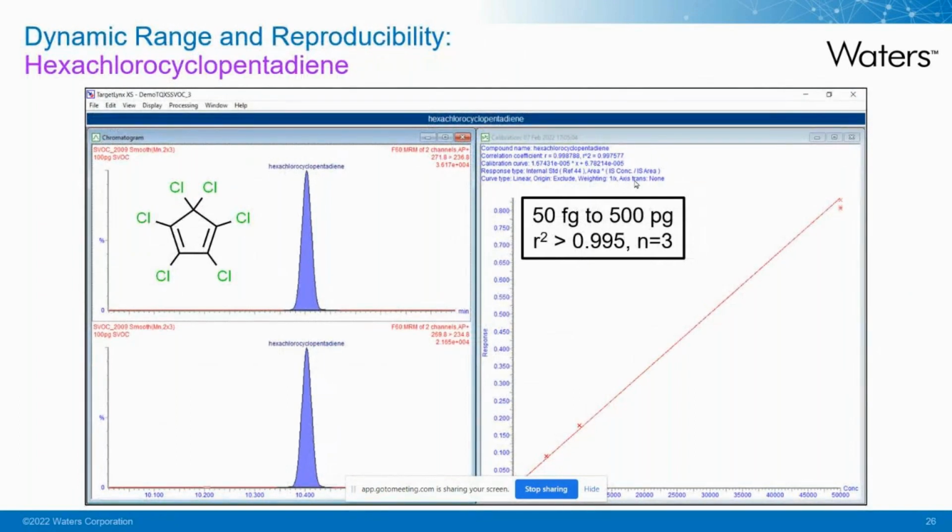And I included the hexachlorocyclopentadiene because it's a precursor for a lot of traditional organochlorine pesticides. Now, initially, I thought, well, I won't include that because it's not really relevant anymore. But on further research, this compound is still synthesized in metric tons in both China and the United States. So something's being done with it. On an industrial level, releases may happen, and analyzing specifically for this compound is still very potentially relevant. Hopefully not, but potentially relevant for environmental analysis.